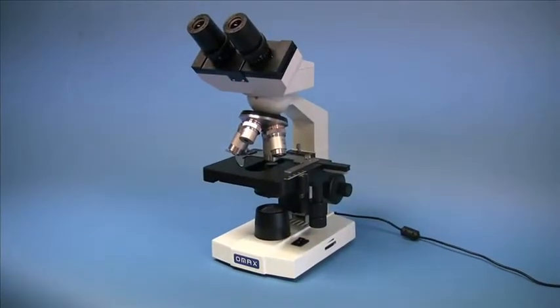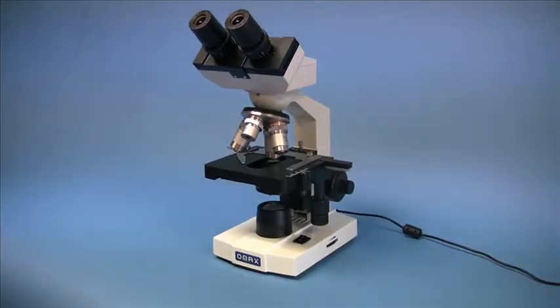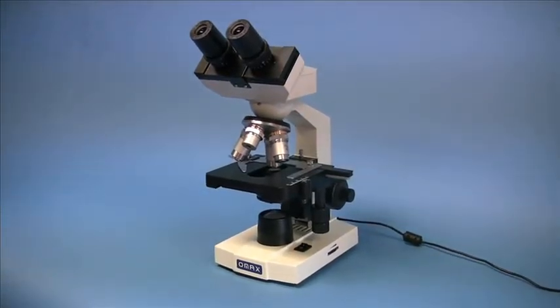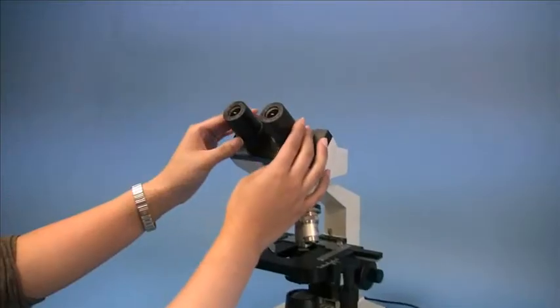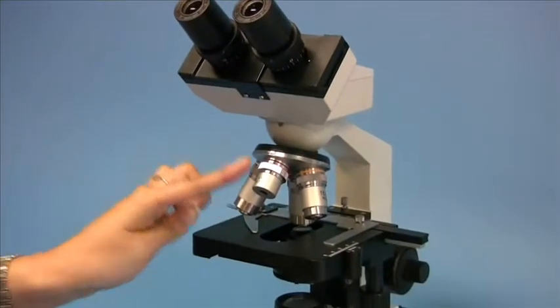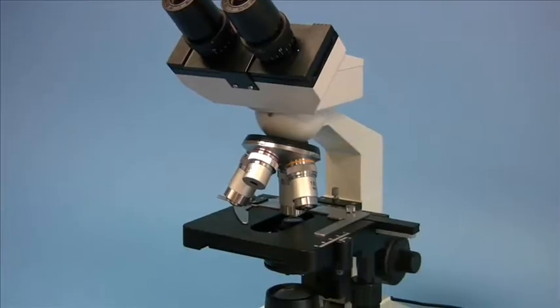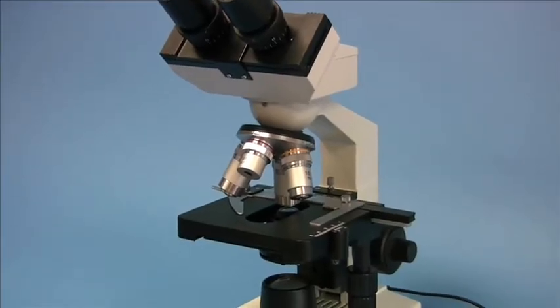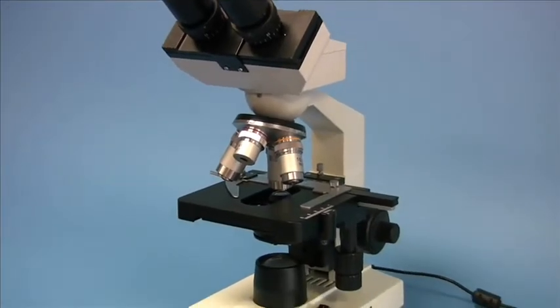The M82ES model of OMAX is a binocular compound microscope equipped with two eyepieces and four objective lenses. Combined together, this microscope allows up to eight levels of magnification.